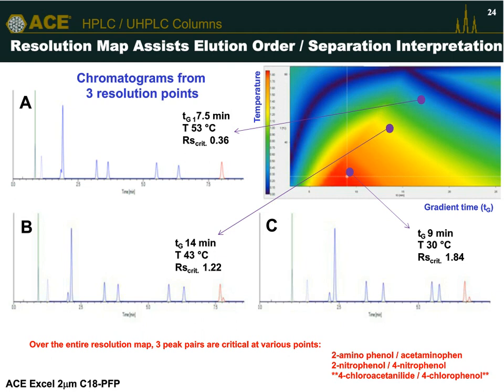So what I've done here is take the chromatogram A. These are predicted chromatograms from the software. From the blue section I've taken a chromatogram, and you can see we've got complete co-elution of the 2 compounds, peaks at the end of the chromatogram. For B, in the yellow color, we've got partial separation of the 2 compounds, and for chromatogram C, the predicted chromatogram within the red area, we've got full separation of the 2 components.